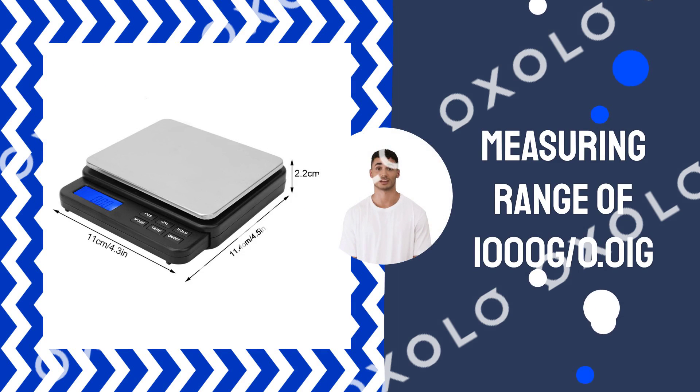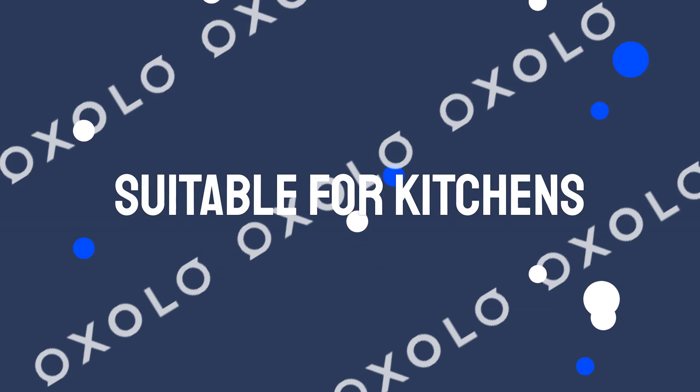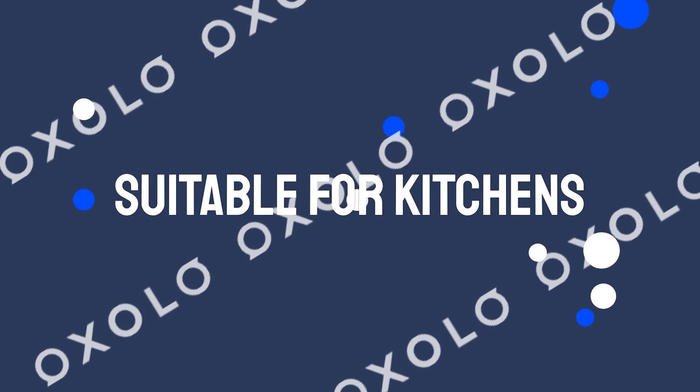With a measuring range of 1000G / 0.01G, it provides accurate and sensitive results. Suitable for kitchens, laboratories, and more, it's versatile and reliable.